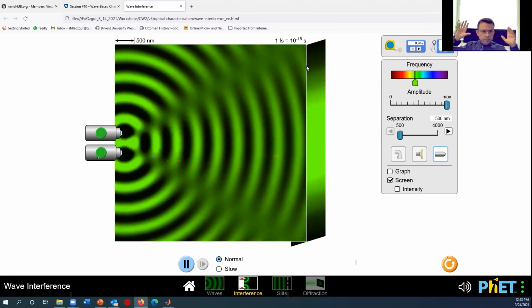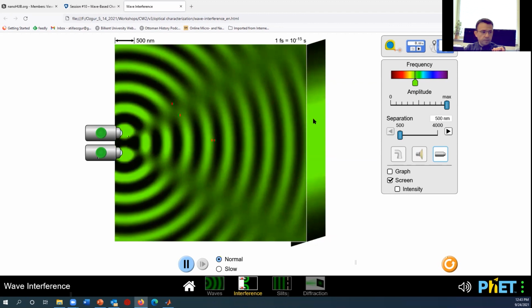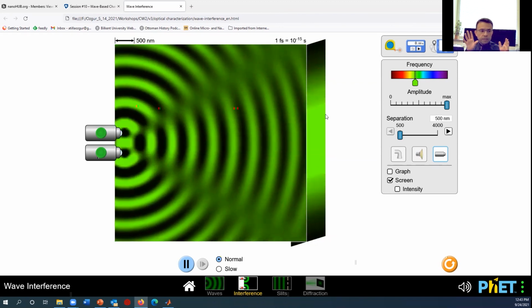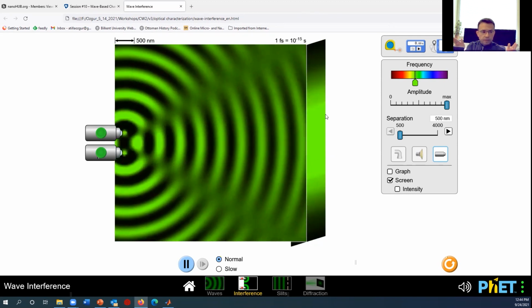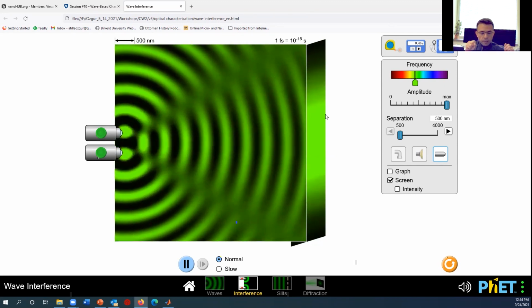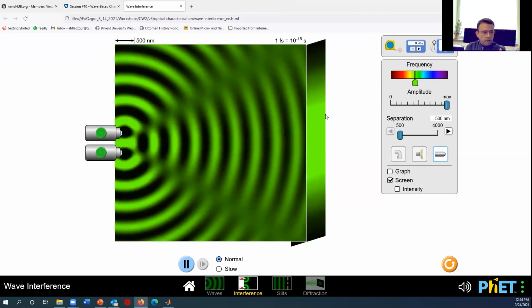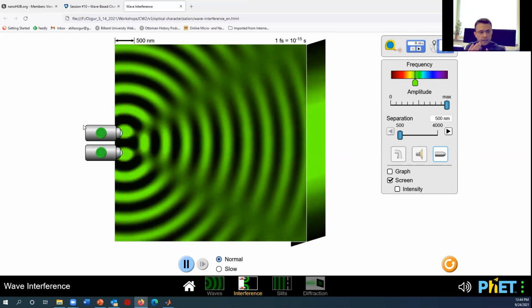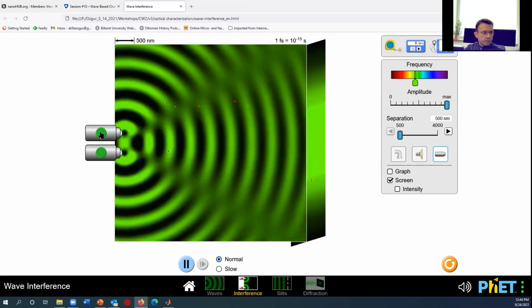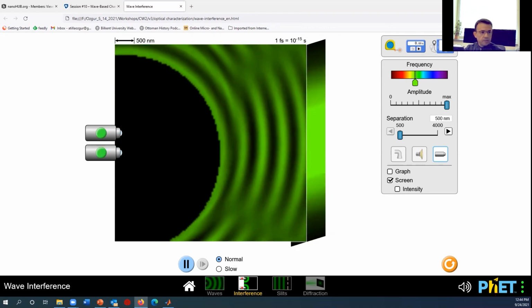So without doing much math or a lot of algebra, we can immediately let the students understand these two relationships. The wavelength and the angle are proportional to each other, whereas the distance between these two sources, in this case it would be our diffraction planes, and the angles will be inversely proportional to each other. So this is going to be the main idea behind the XRD analysis too.